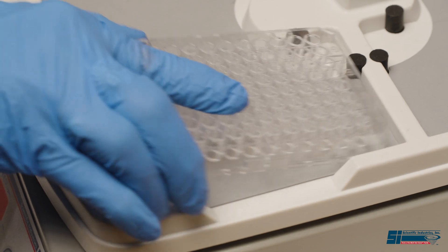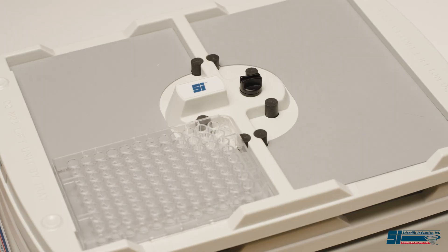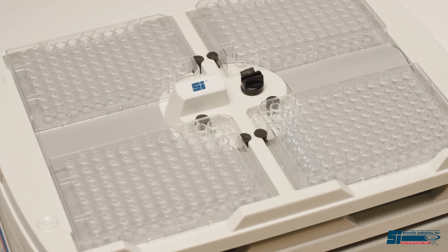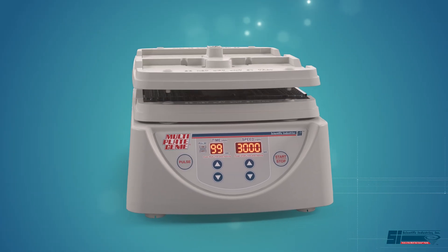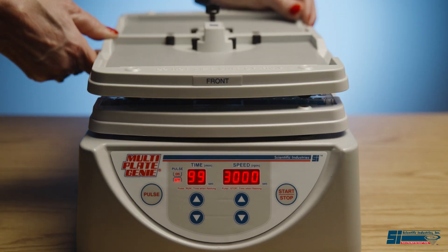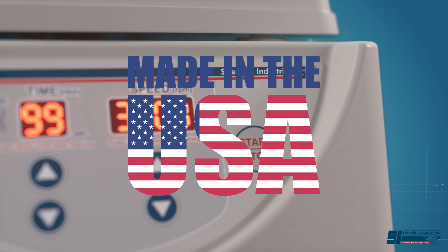Fast and easy loading and unloading of your plates saves you time in the laboratory. This MultiPlate Genie handles up to 4 microplates, or up to 8 plates with the optional accessory tray.